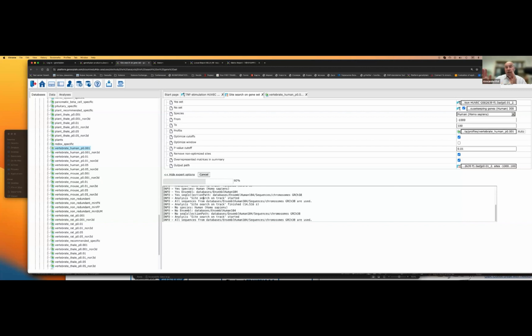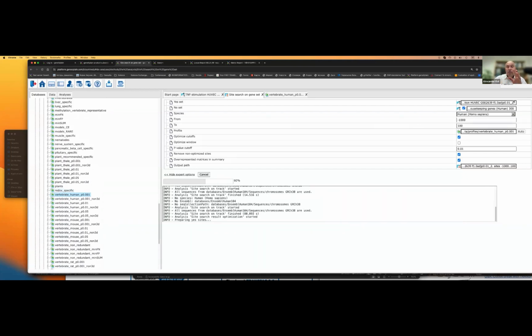They found out that depending on the tissue, the position varies very flexibly. Genes are different. For some genes it's very stable, for some genes you see a very big variability. And this tissue-specific TSS information we have in our system. It's stored in a database here, and we have a tool in our hands to analyze promoters when you know the tissue. This tool is actually also available for you.